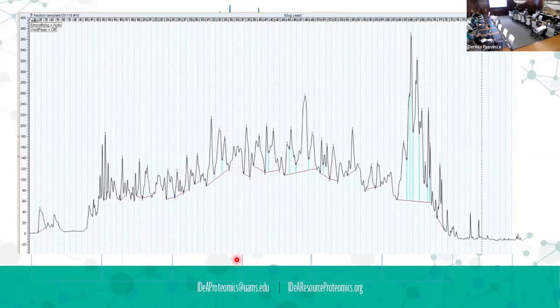And you would probably end up loading more. The advantage of fractionating and loading on nanoLC is that we can only load one microgram on nanoLC. So if we load one microgram of a lysate, that's all we can load. But if we can take that lysate and fractionate it into 12 different fractions, now we can load one microgram of each of those fractions. So it's like we're loading 12 micrograms of lysate. And so now those peptides and proteins that are tenfold below our detection limit are now up to our detection limit. This is why I almost didn't show this, because it's late in the day to think about it.